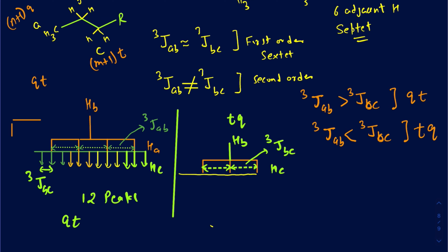So maybe I can just go ahead and draw a straight line first. And each of those splittings that you have here, that was the triplet, they're going to split further down into a quartet. So that's what triplet of quartet really means. So every one of those I would have maybe 4 lines now. So because of this first signal right here, I should see a clean quartet. So you have the triplet first, and I'm going to see a quartet because of each of these lines.